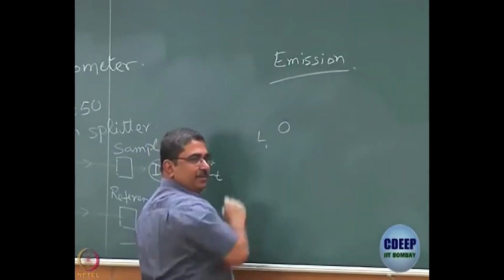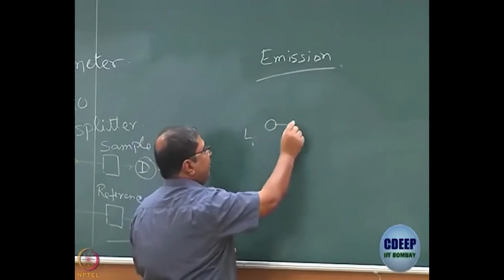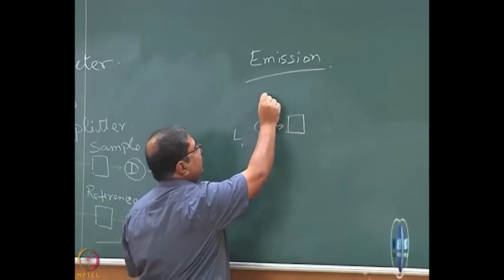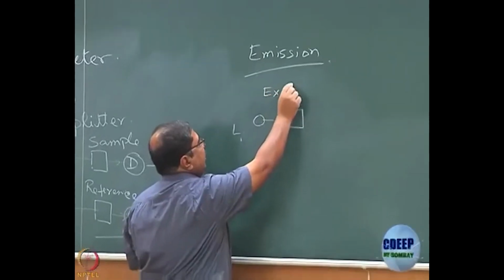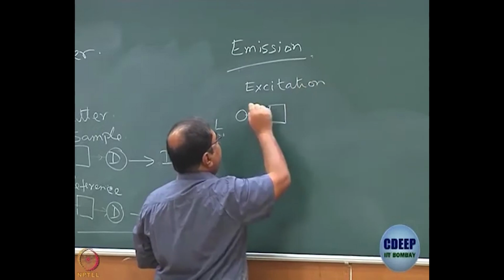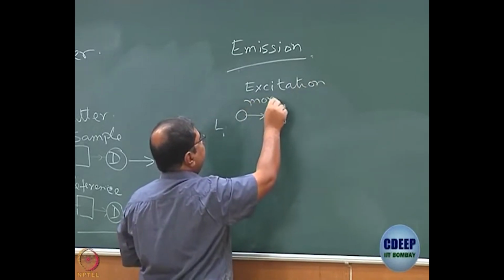I have a lamp, then I put in a monochromator. I will call this the excitation monochromator.